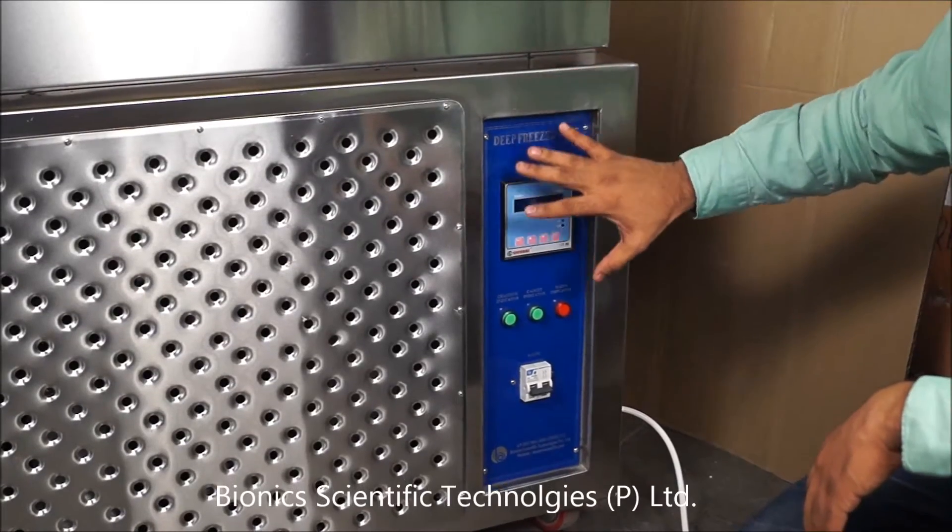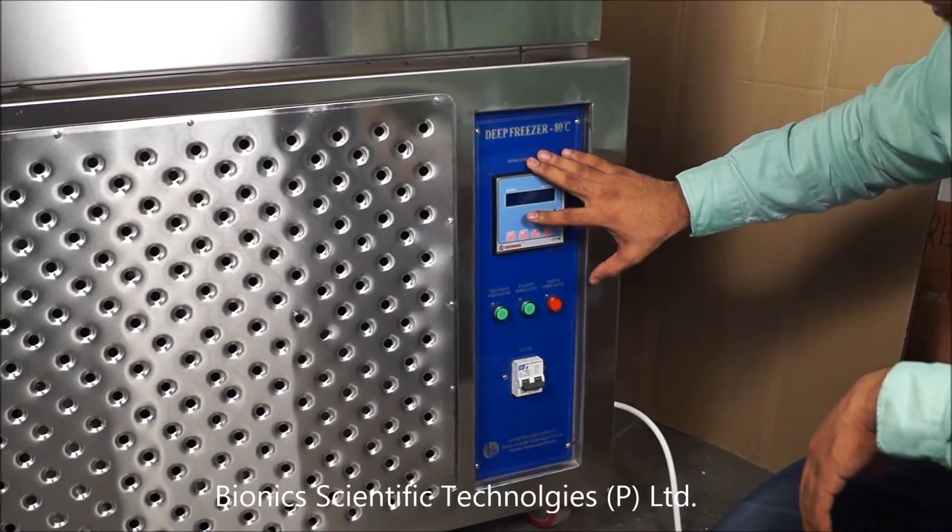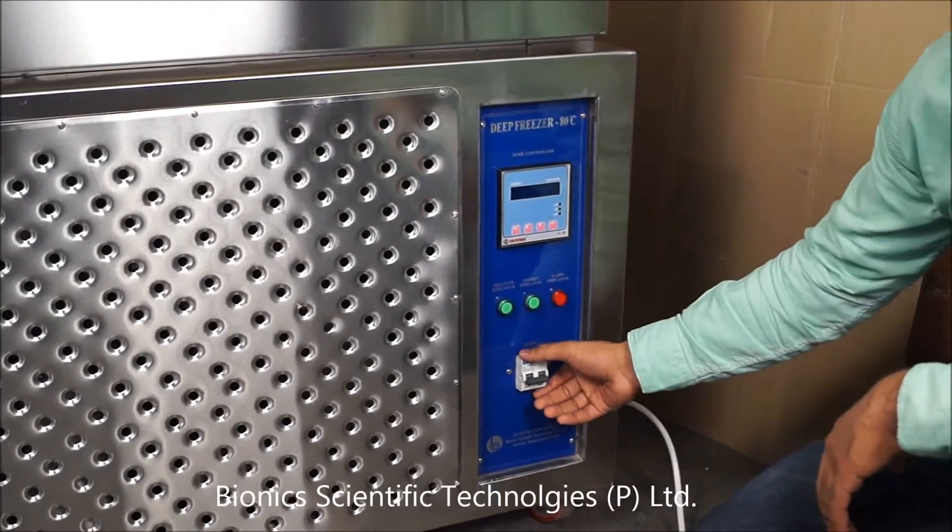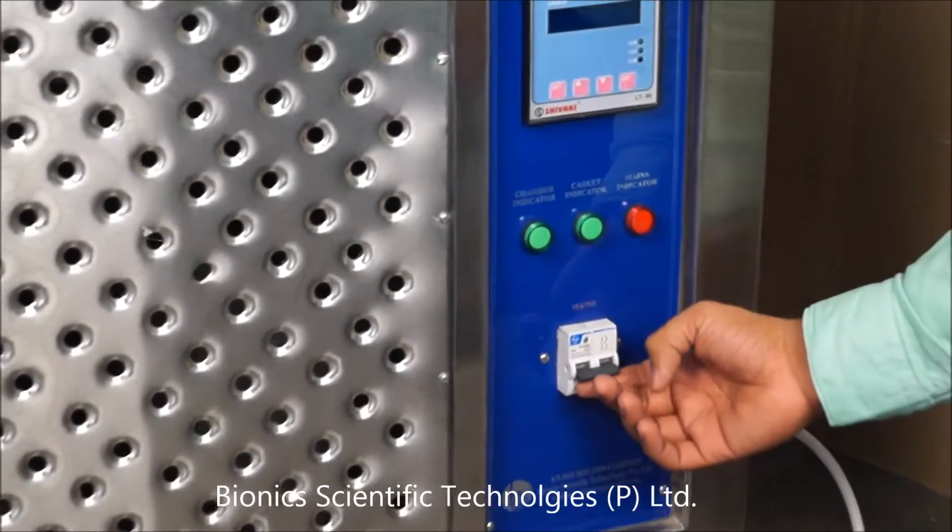This is the control panel of this laboratory deep freezer. This is the main MCB switch. You can turn it on like this.